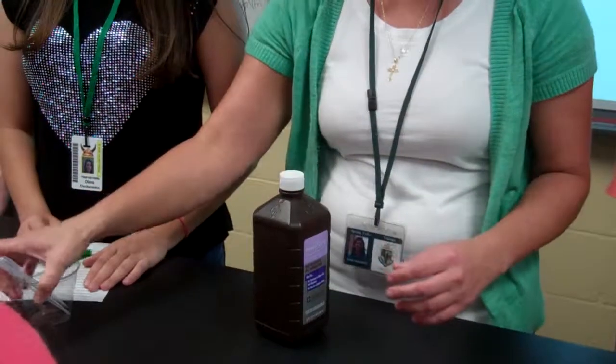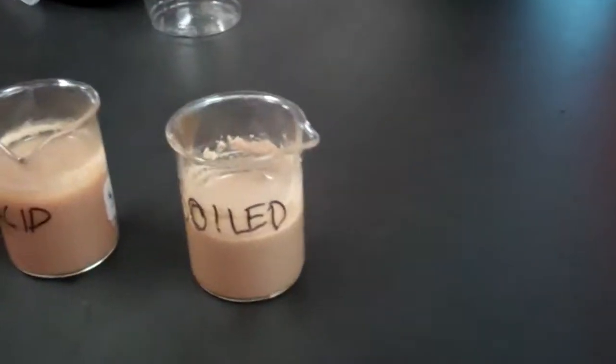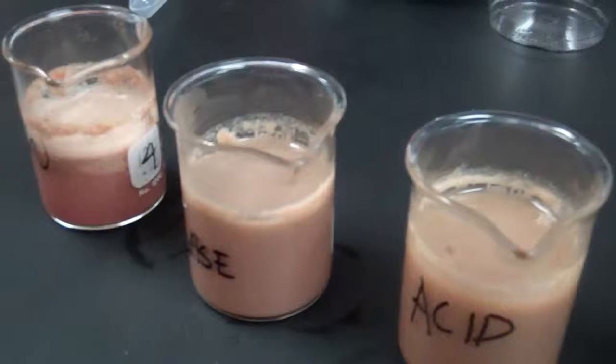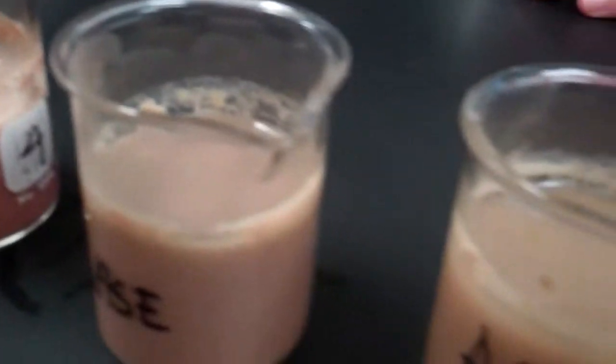Okay, this is hydrogen peroxide. So I'm going to pour this in here. Oh, before I do anything, make sure you write observations about how the liver looks now. Because once you record what it looks like, we'll add hydrogen peroxide to it, and then you guys will have to decide what has happened to it.